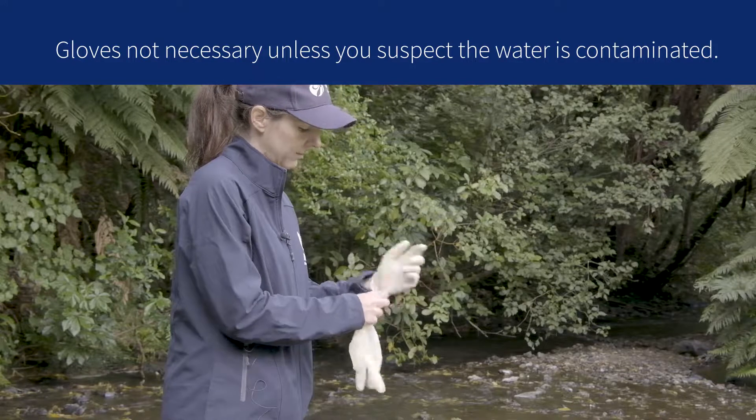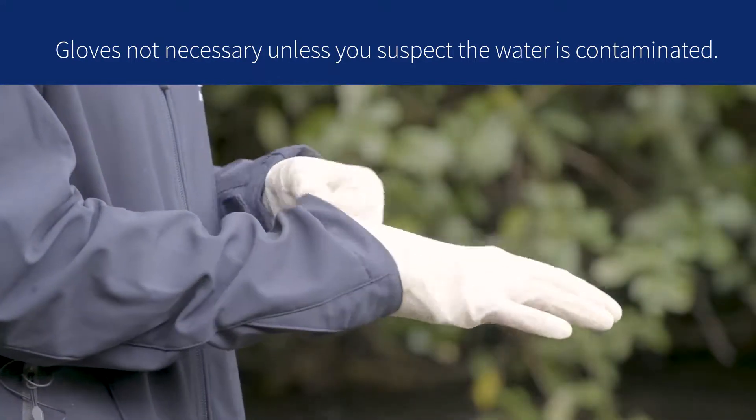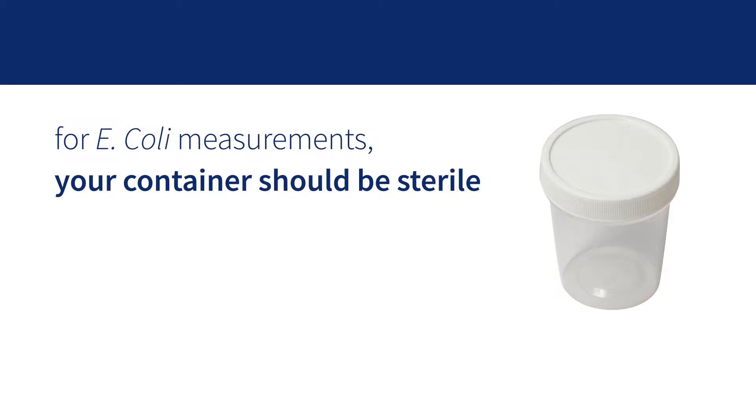Make sure your hands are as clean as possible so that you don't contaminate your sample. If you're collecting a sample for E. coli analysis, your container should be sterile.